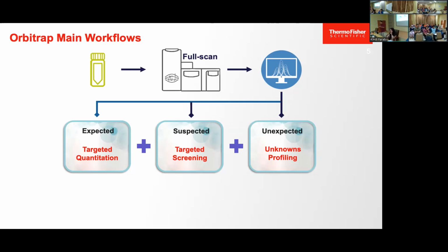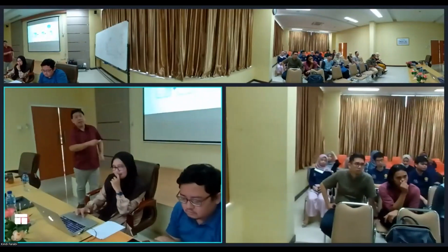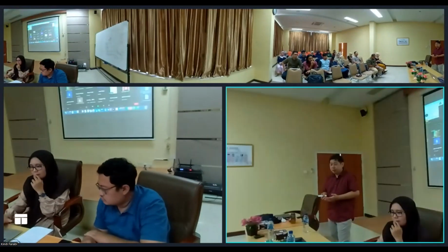What do you expect we need to check on telur? Vet drugs, veterinary drugs. Because the feed that the chicken takes may have certain drugs to make the chicken stronger and not fall sick. So this is why those vet drugs may also pass on to the telur. So this is called targeted screening. And we might also expect something present in the feed sample: dioxin, furan, PCB. So all these need to be screened.